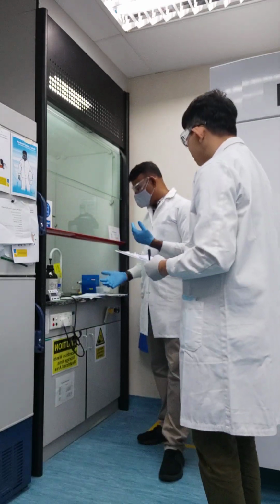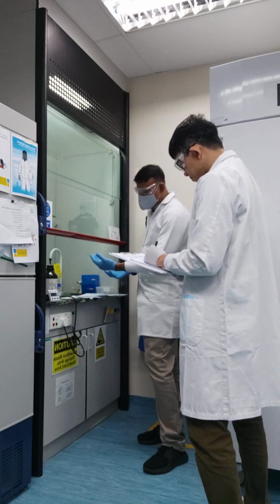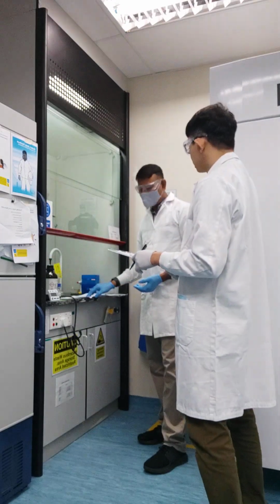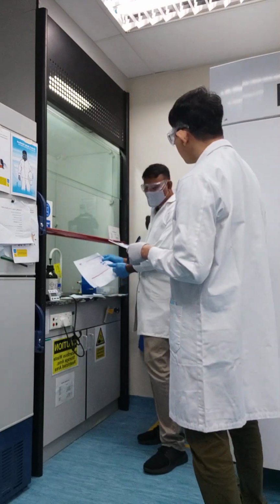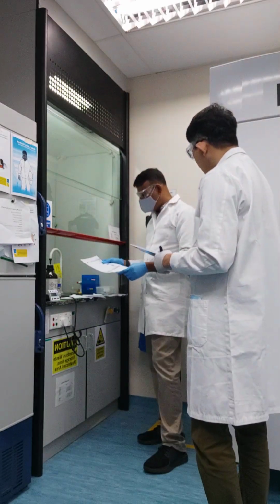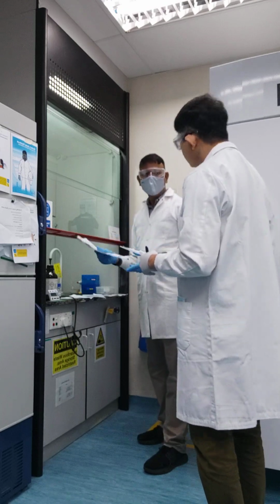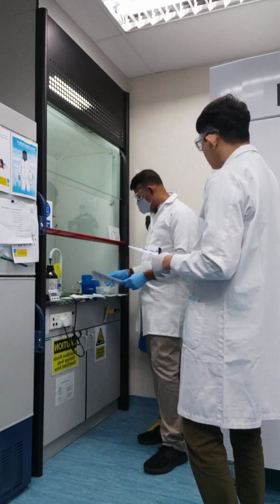Okay. So just to reinforce the steps that we learned. The first step is we went through verifying the chemical against its batch sheet, making sure we choose the correct chemical. The second step is ensuring that we have the correct safety data sheet, and in the safety data sheet, I've given you the instruction where you can find the hazards of the material and the appropriate personal protective equipment that we need to use in handling this material.